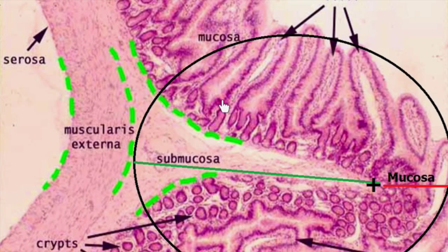Here we have a very specific feature for the small intestine, which is the plica circularis. This plica circularis is a circular mucosal fold. It's a fold of the mucosa, which contains a submucosal core of connective tissue, which increases the surface area for the absorption about 3 folds.